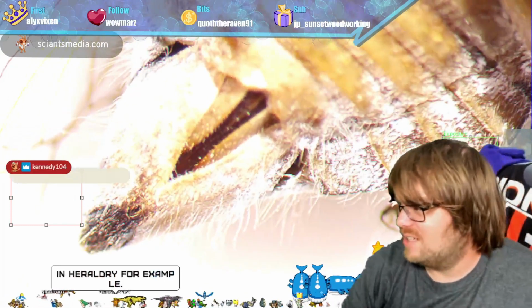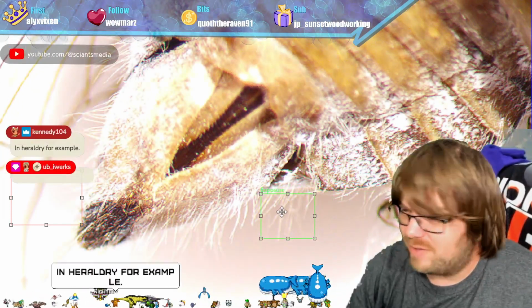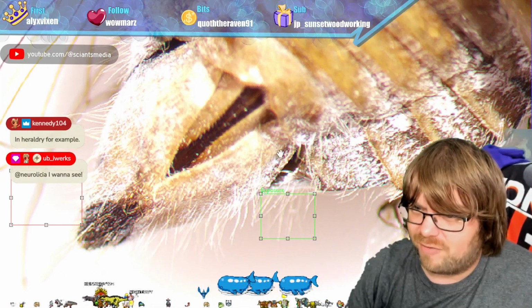Quoth wanted to analyze if this is female. This is female. That is an ovipositor right there, Quoth the Raven. So we do in fact have a female here.